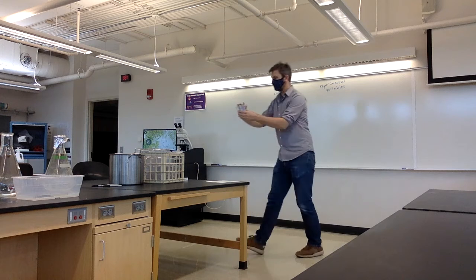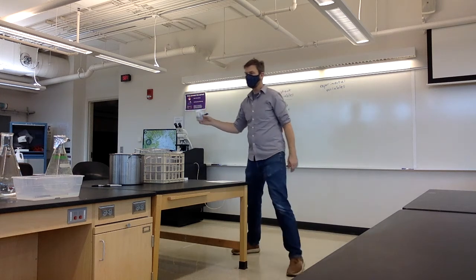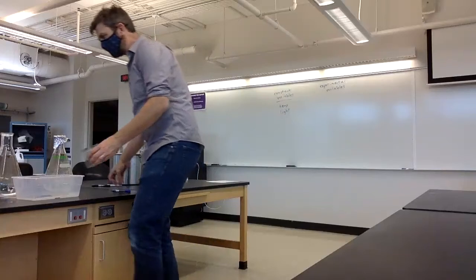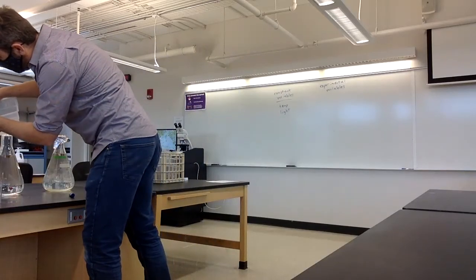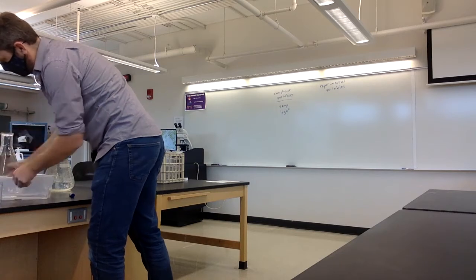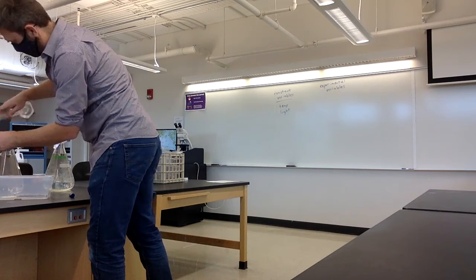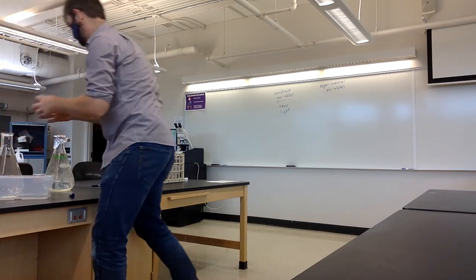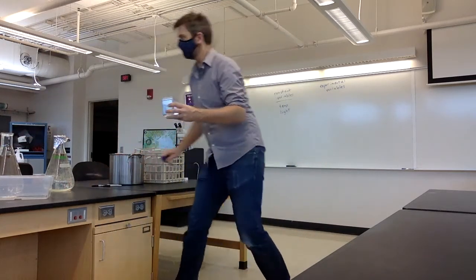So this will be our container. There's a little growth vessel here. I think it's at 200 milliliters. Perfect. So I've got graduated cylinders. We can measure out the amount of water that goes into here.